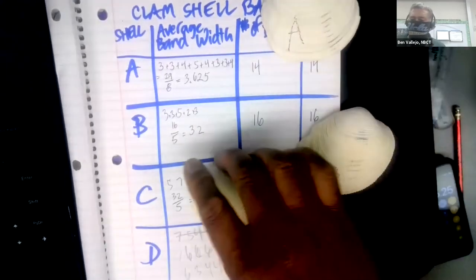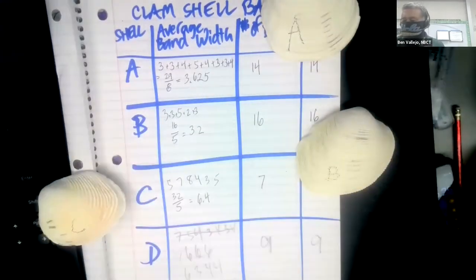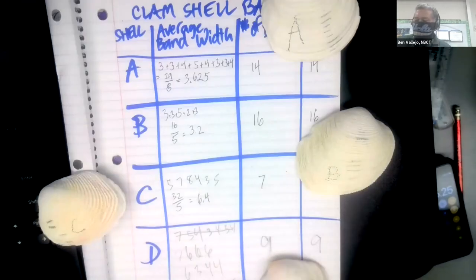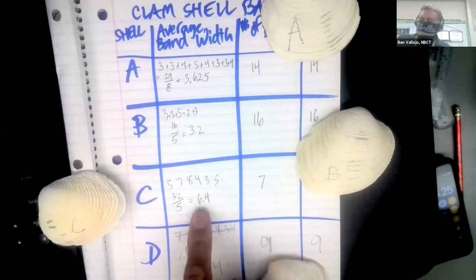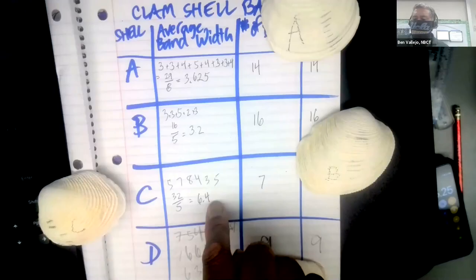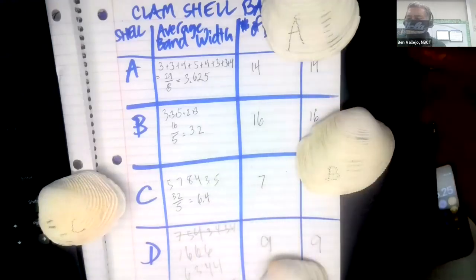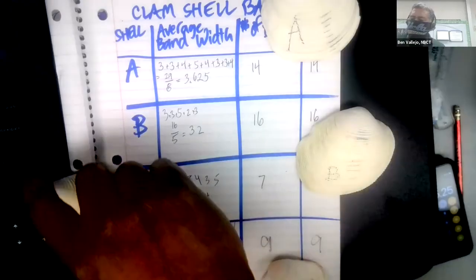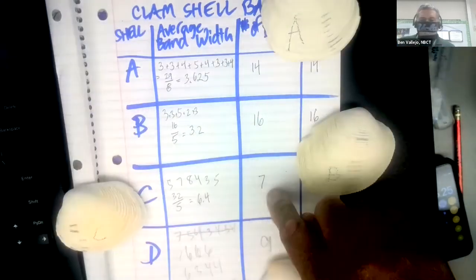Right, that's letter C, and then this one here, letter D. Also almost as big as C, but you can see that the bandwidth was a little bit smaller than C. Interesting that this guy had the largest bands compared to all these other three. And it's almost as big as the A and B, but it is definitely the youngest.